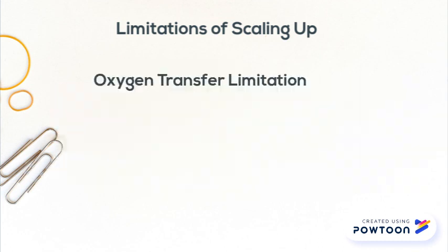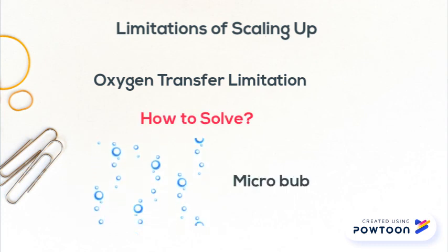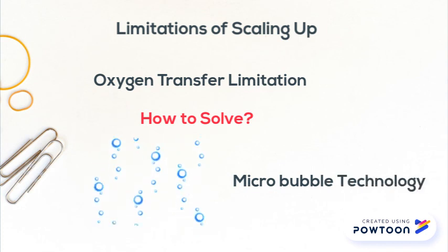Another limitation encountered is oxygen transfer limitation. A proposed solution is to introduce microbubble technology and soluble surfactants in order to meet the cellular oxygen uptake rate.